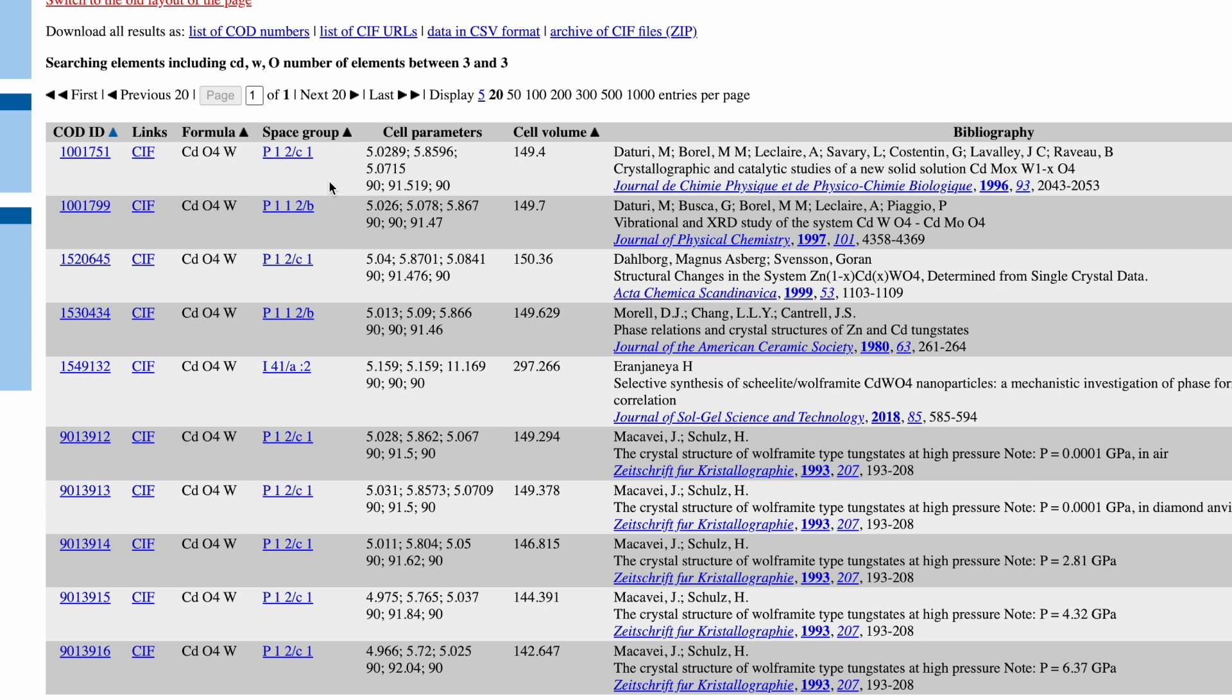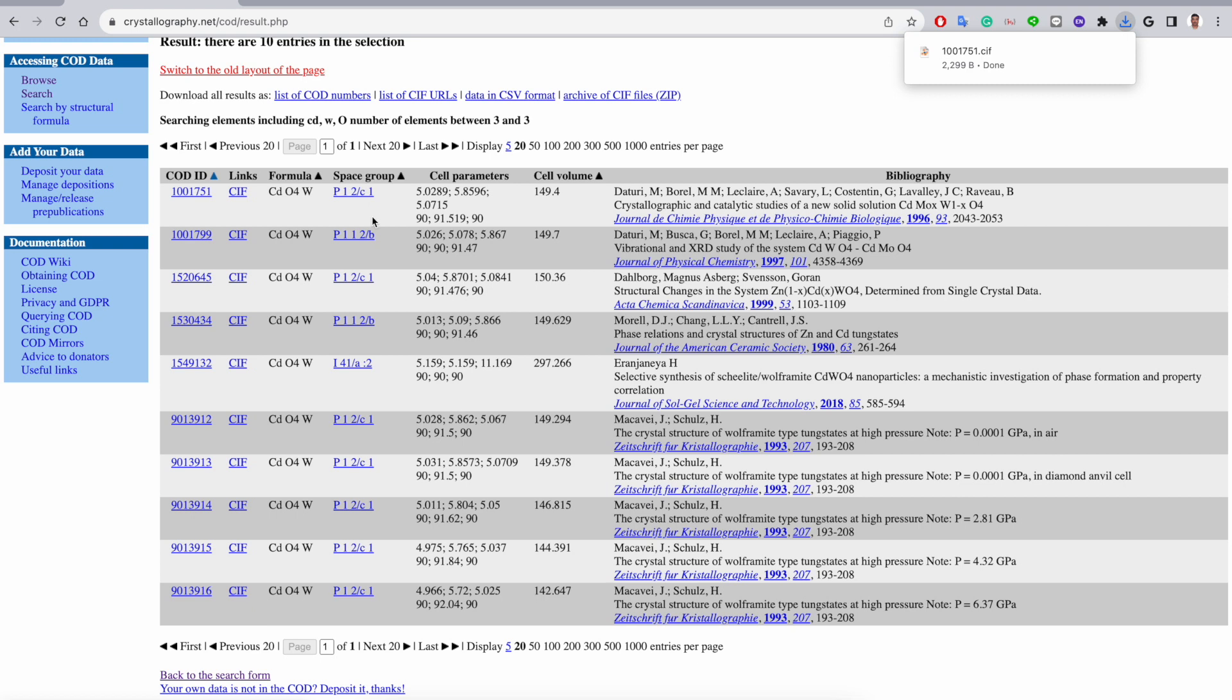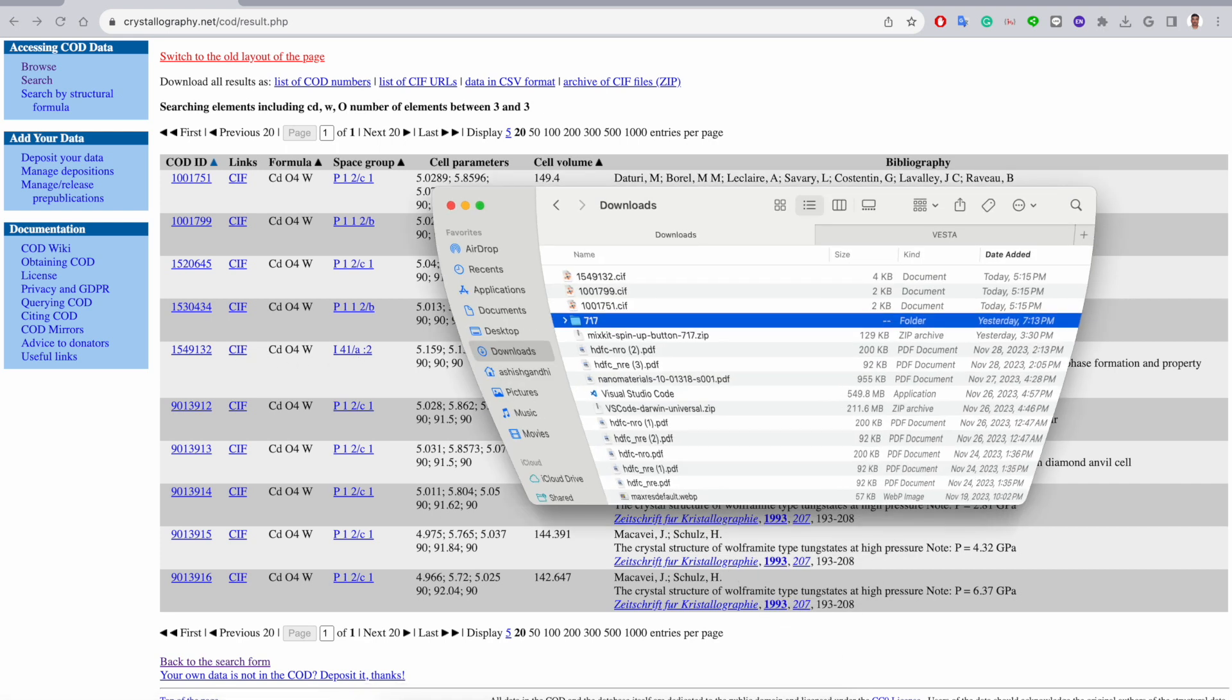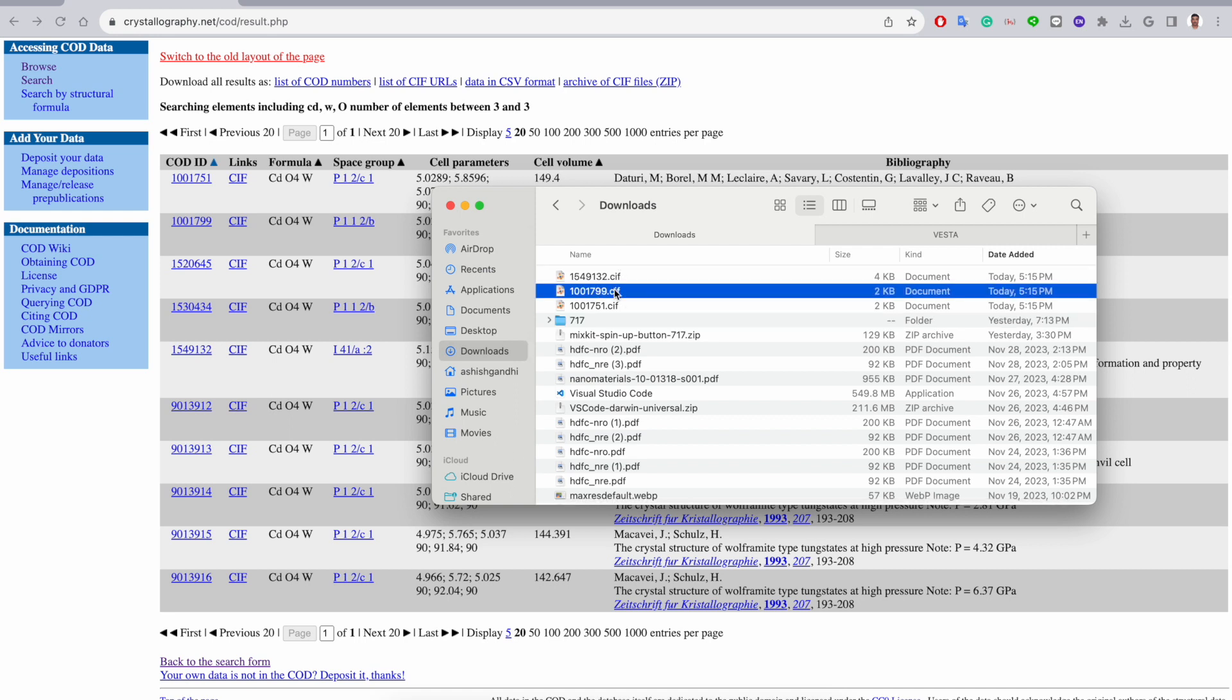So let's click on this CIF file and it will automatically download it. It has a space group of P1 2/c 1. Let's consider the second example - it has P1 1 2/b. And then the fifth one has a space group of I41/a. Go to the download folder. These are the three CIF files. For simplicity I will give them names as A, B, and C.